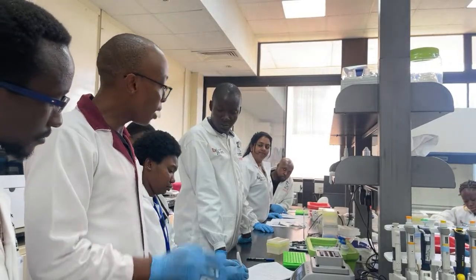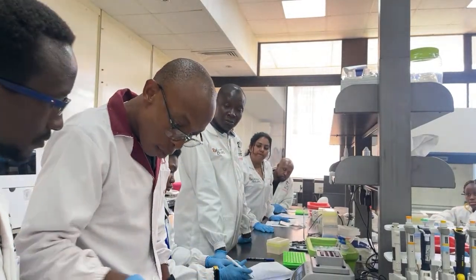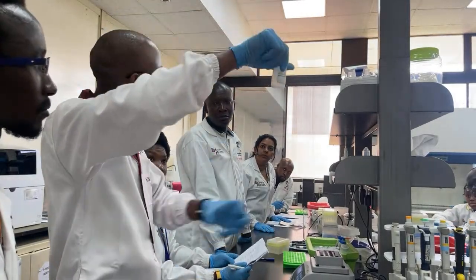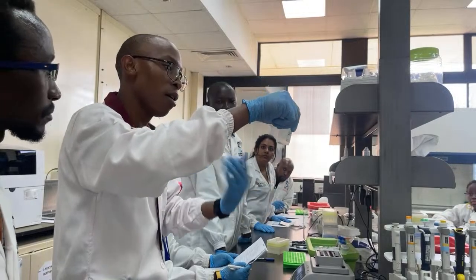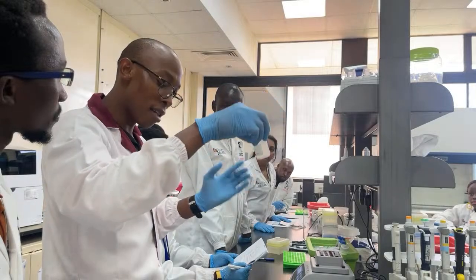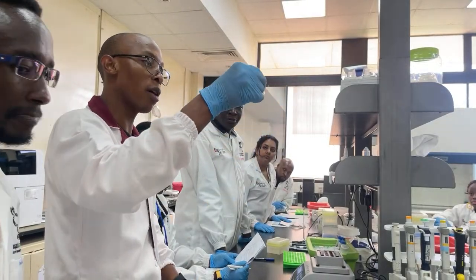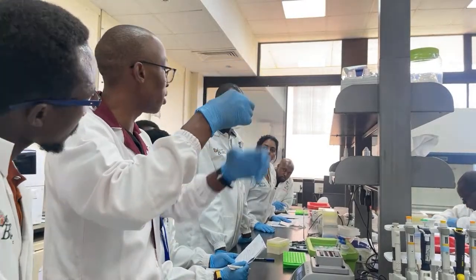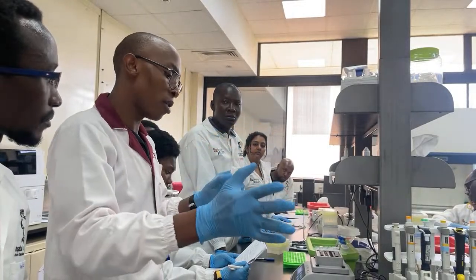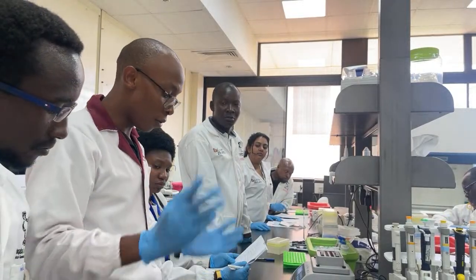And then eluting, that's where we're going to have to introduce the Nanobind disc. I think it's somewhere in here. This is the disc that the DNA wraps around. And then we do a few washes. If you're not careful at this step, you can lose the DNA. So we just have to give it enough time to wrap around the disc, and then we separate the rest with the magnets, and then we'll have our beautiful DNA there to work with.